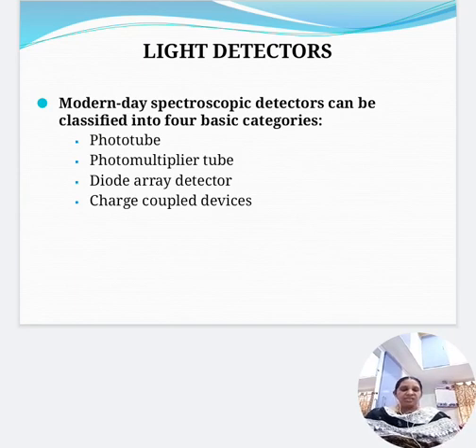Photon detectors are spectrally selective. They consist of an active surface that absorbs the radiation that falls on it, and because of this active surface, they begin to emit electrons for generation of photo emission current, or photo current. When UV, visible or near infrared radiation falls on the active surface of the photo detector, emission of electrons takes place, causing photo emission current, as in the case of photo emissive cells.